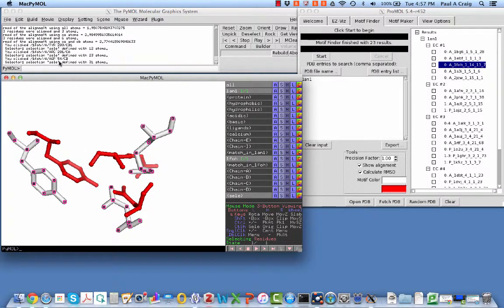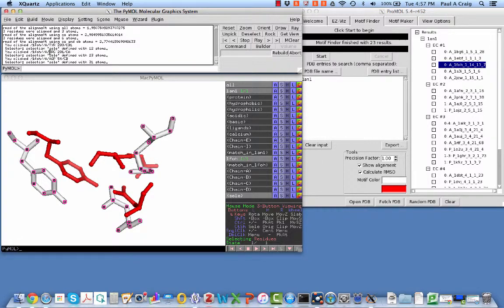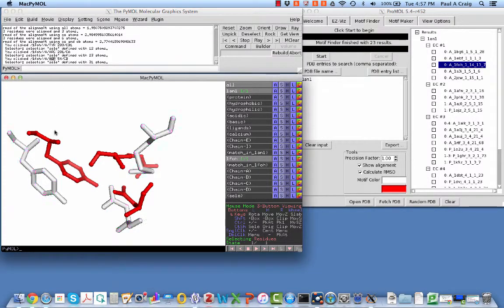We see that this template has an arginine and also an aspartate. Now when I look at the query structure, I also get a tyrosine, an arginine, and an aspartate. So you can see exactly what you're looking at when you click on it. It shows up in the external GUI. So that's one measure of quality, the number of residues that are there.